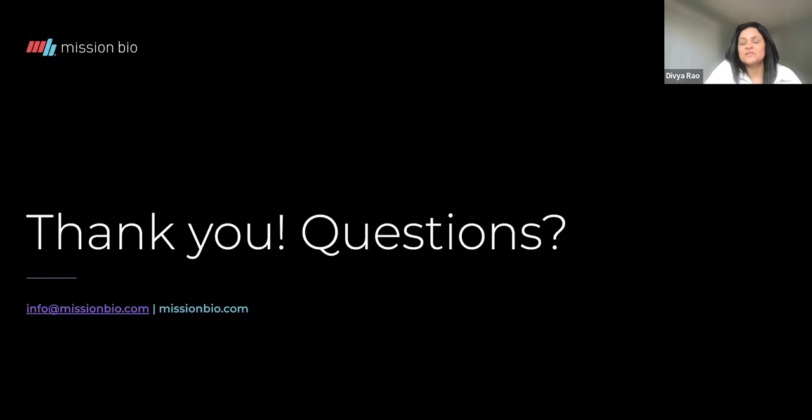Thanks, Christy. When you look at bulk methods like bulk NGS, you're again looking at averaged out data, right? Single cell sequencing provides that resolution and granularity where you can look at the co-occurrence of mutations, how they come together to provide added fitness and strength, and what the clonal diversity of these mutations is.